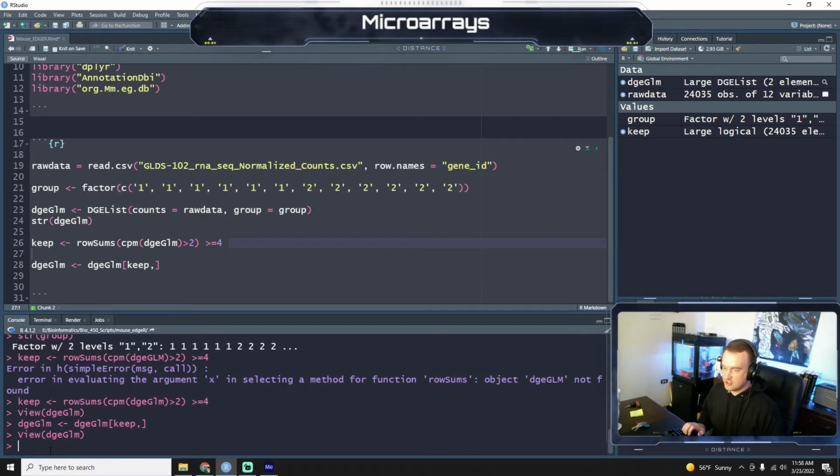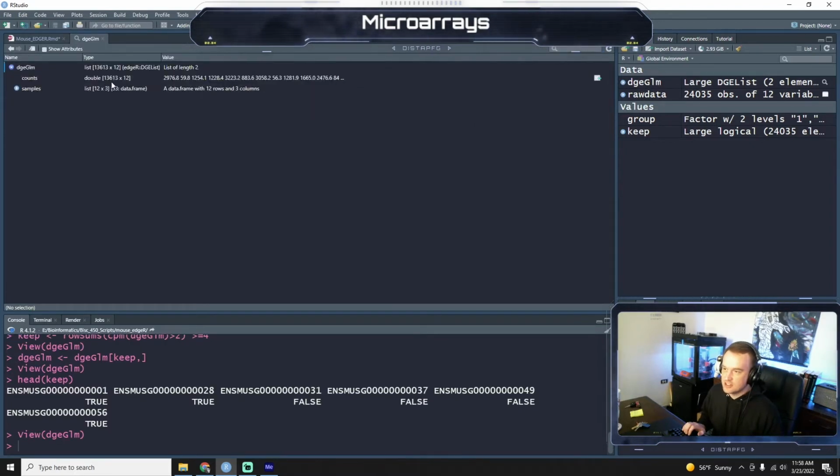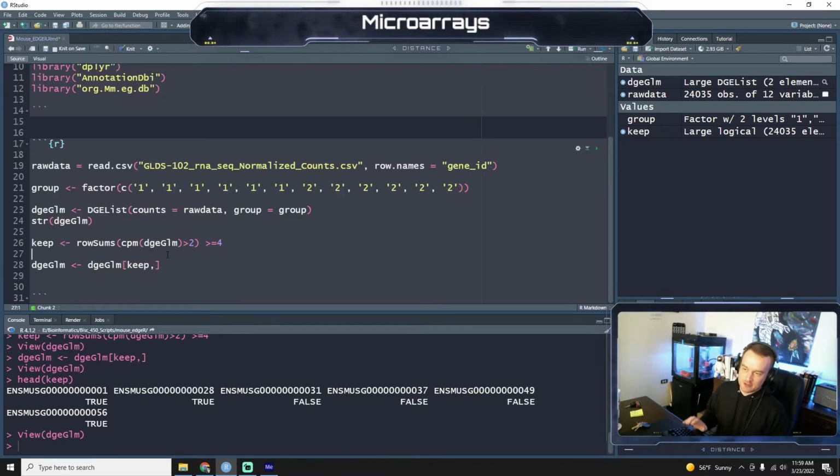So it's a large logical. If we look at head keep, it's saying whether to keep it as true or false. And then depending on true or false, we say which ones to keep. So we started with 24,000 different observations, and now we're down to 13,600. Got a little ahead of myself.